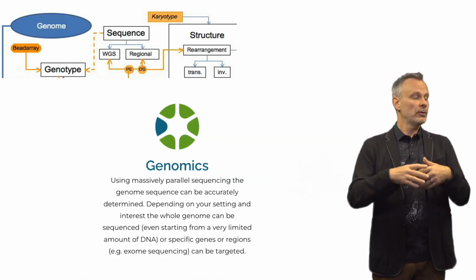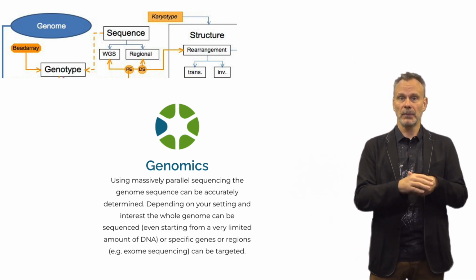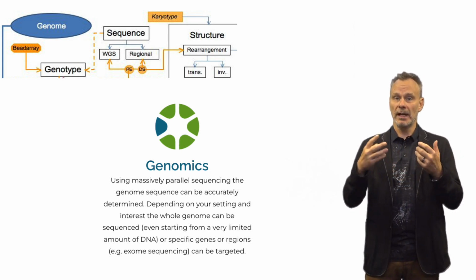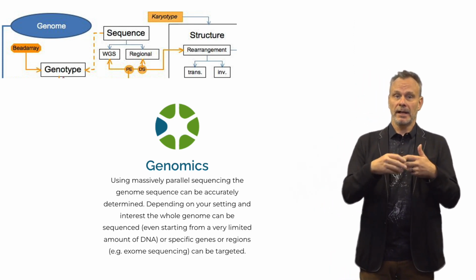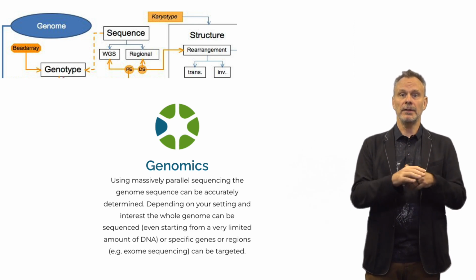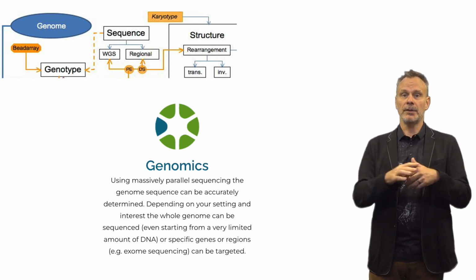Now let's take time to focus on the different application domains this technology can be used. The first domain that I will zoom into is genomics. In the genomics part, we focus on DNA sequencing, de novo genomic sequencing of organisms, exome sequencing in humans or other animals, design and validation of targeted panels like exomes, both in model and non-model species, targeted gene sequencing, panels focused on specific diseases, shallow genome sequencing, copy number alterations.